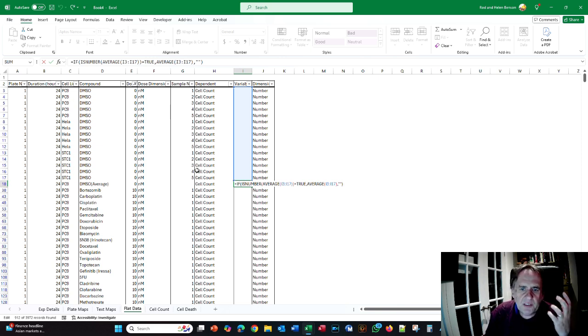which of course is fine if you're happy with a global average, but of course it can be a problem if the averages for each cell line are very different. So if all your background for each cell line is fairly equivalent, then it could be appropriate just to use a global average across the cell lines for each cell line. But what you may want is a local average.